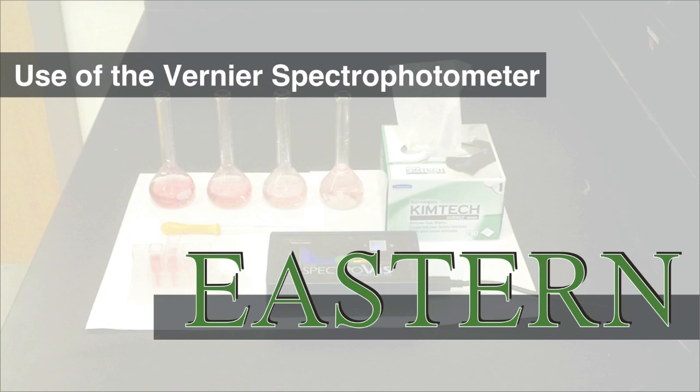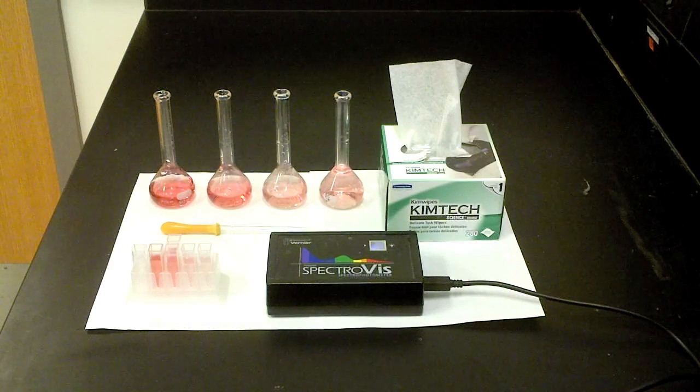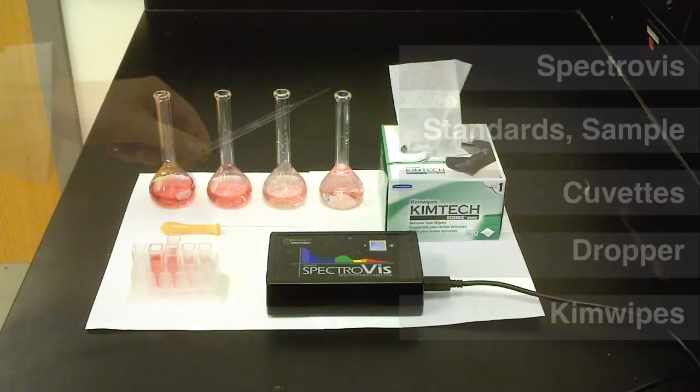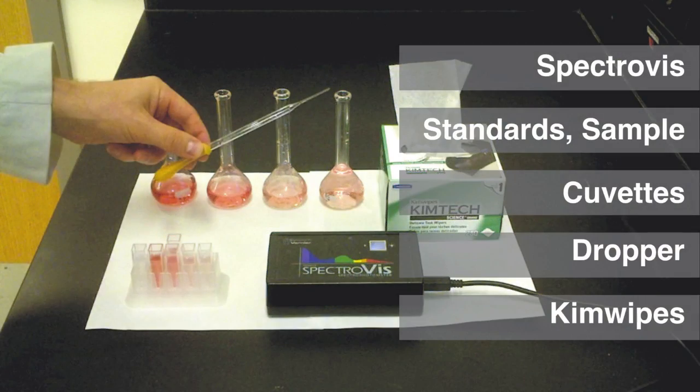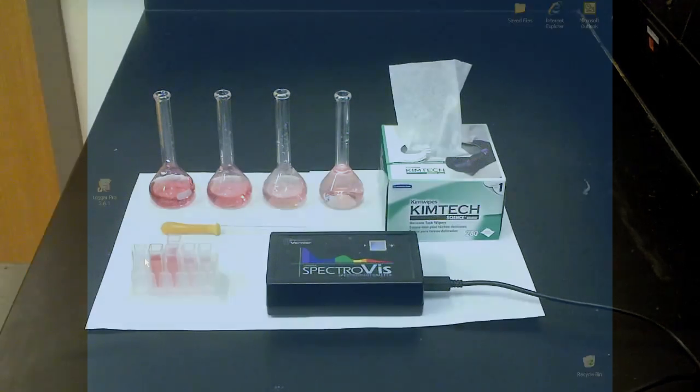I'm back again with another tutorial, this time we'll be checking out the Vernier Spectrophotometer. You're gonna need a few things so get prepared. I don't like waiting around. Right. Let's get started.